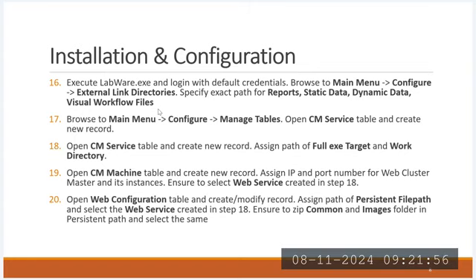When it comes to static data, the static data I prepare in the LIMS application will be stored in one folder. The same path shall be updated in the LIMS application. The same goes for dynamic data. Here I want to conclude one thing. If someone asks what is the difference between static data and dynamic data: yes, there is a difference.